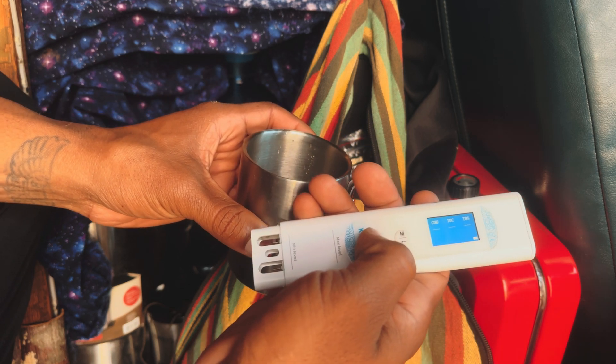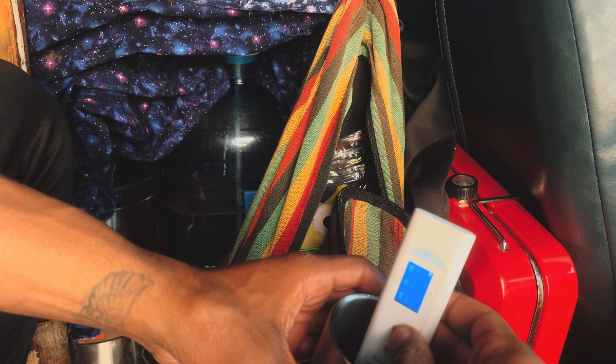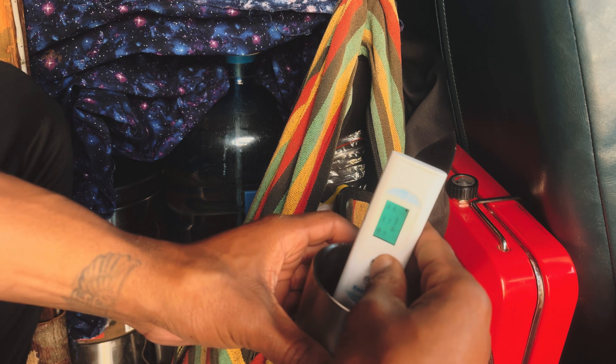Alright y'all — it says 88, oh my gosh. The water that I've been drinking is good quality — it's an 88 rating. I guess that's better than drinking pond water or stream water. I was nervous for a second because I didn't know what to expect, and I was scared I was drinking some dirty tap water. I don't know — it was fizzed up the first time I got water in the container and then it cleared up at another spigot, so I was kind of worried. 88 — I'll take it.